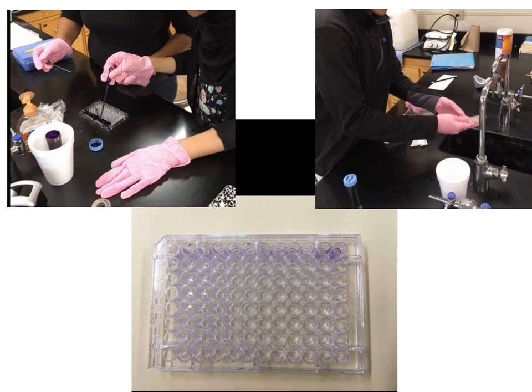Then at the conclusion of the 3 nights that we let them grow, we would dump out the plate of bacteria. So we would be trying to put all of the loose bacteria down the drain. To remind you, some of the bacteria will be inside biofilm colonies. So some of the bacteria will be stuck in their goo or in their matrix, which is their biofilm. Those bacteria would not become dislodged when we dump the plate. So we are just dumping any loose bacteria.